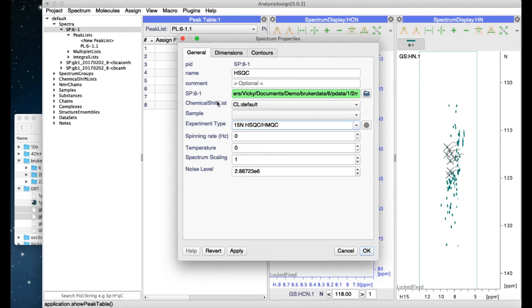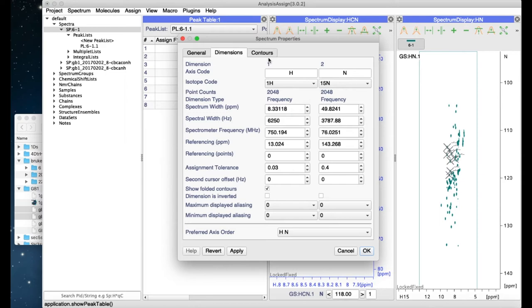In the Dimensions tab, you will see information about referencing and you can also change the contour colors here if you like.